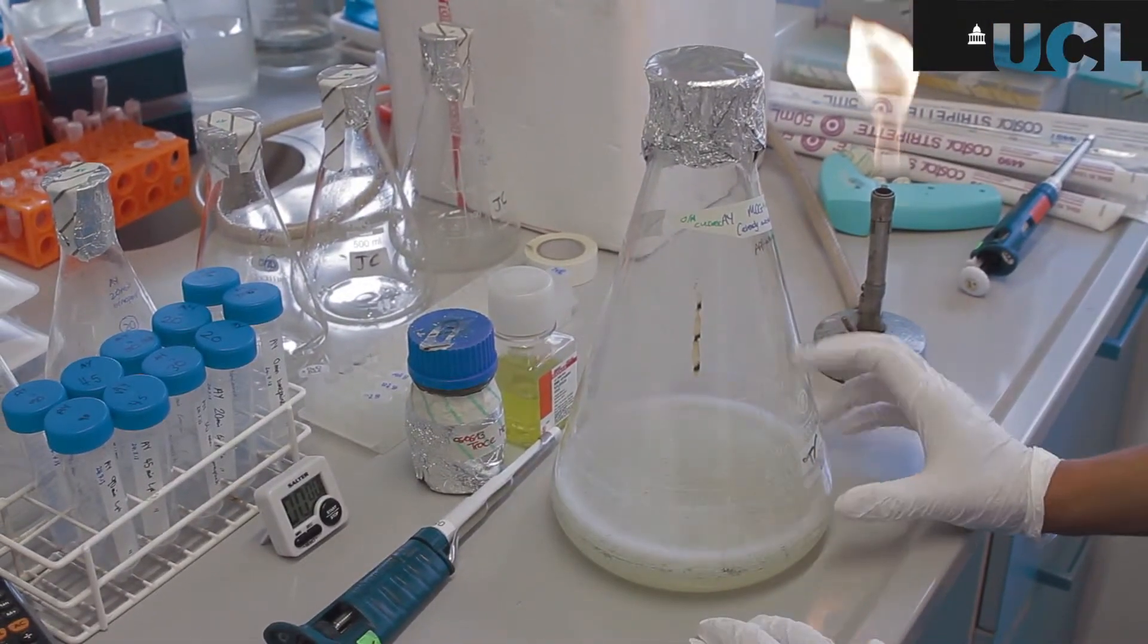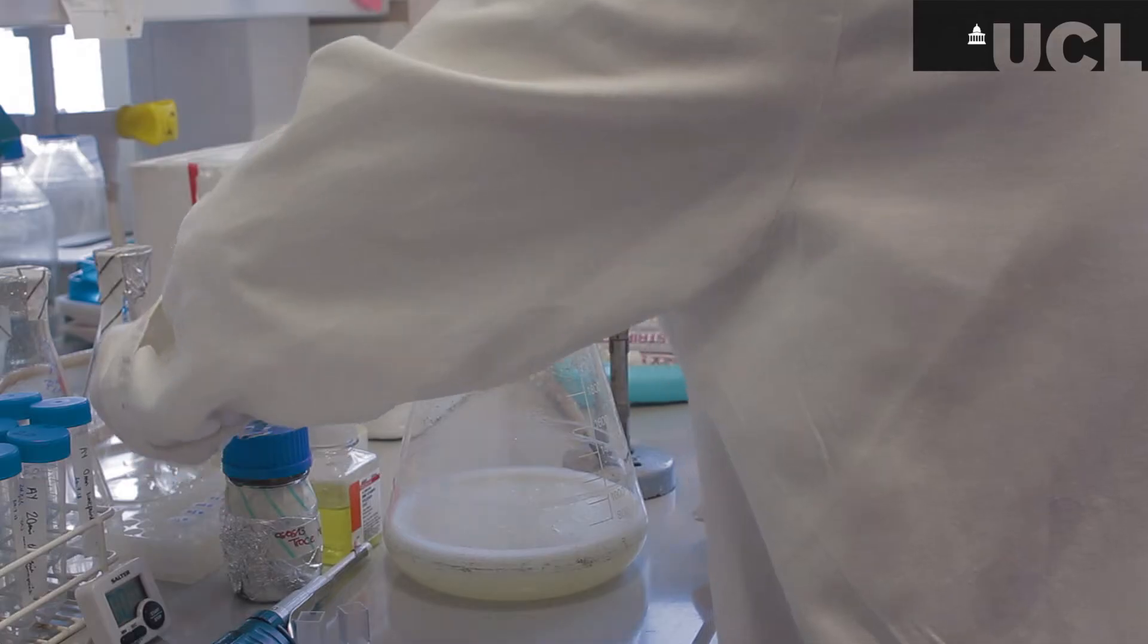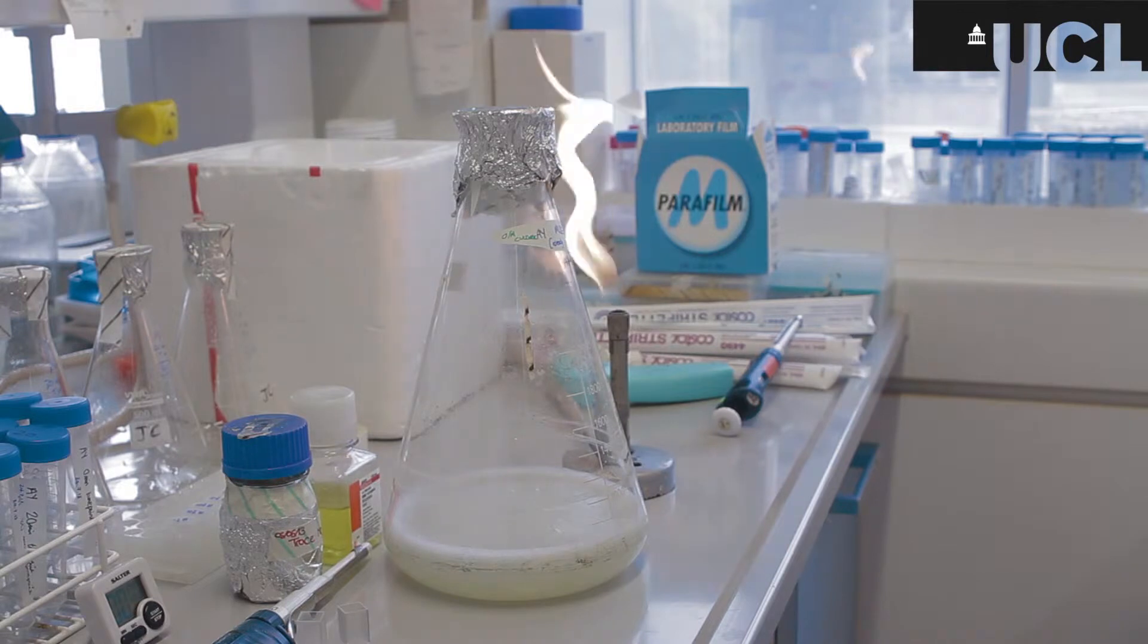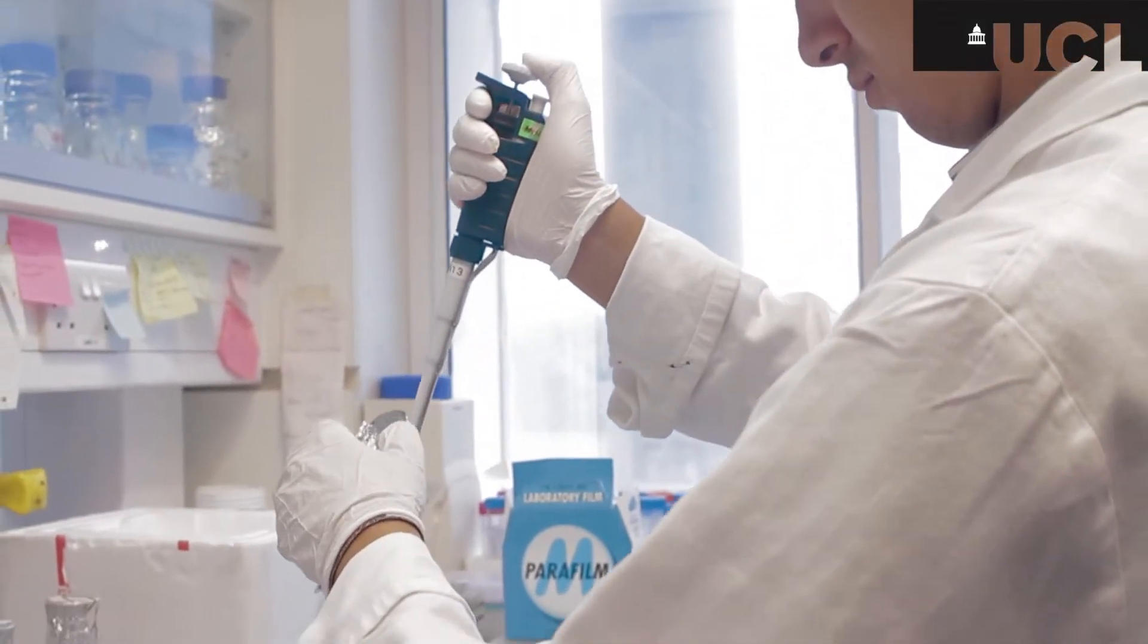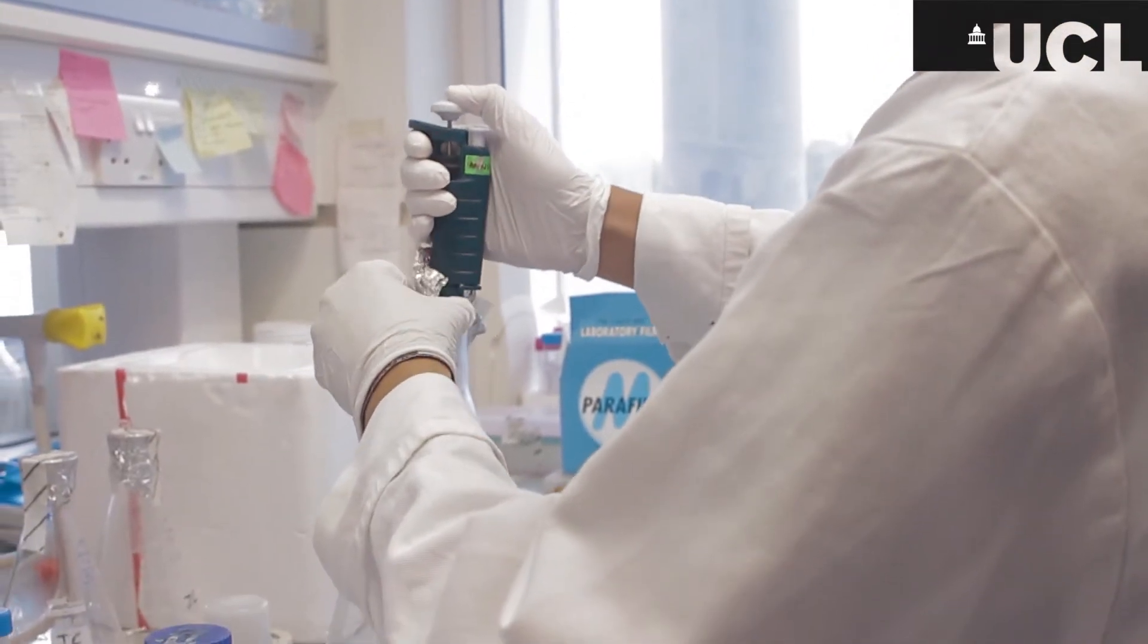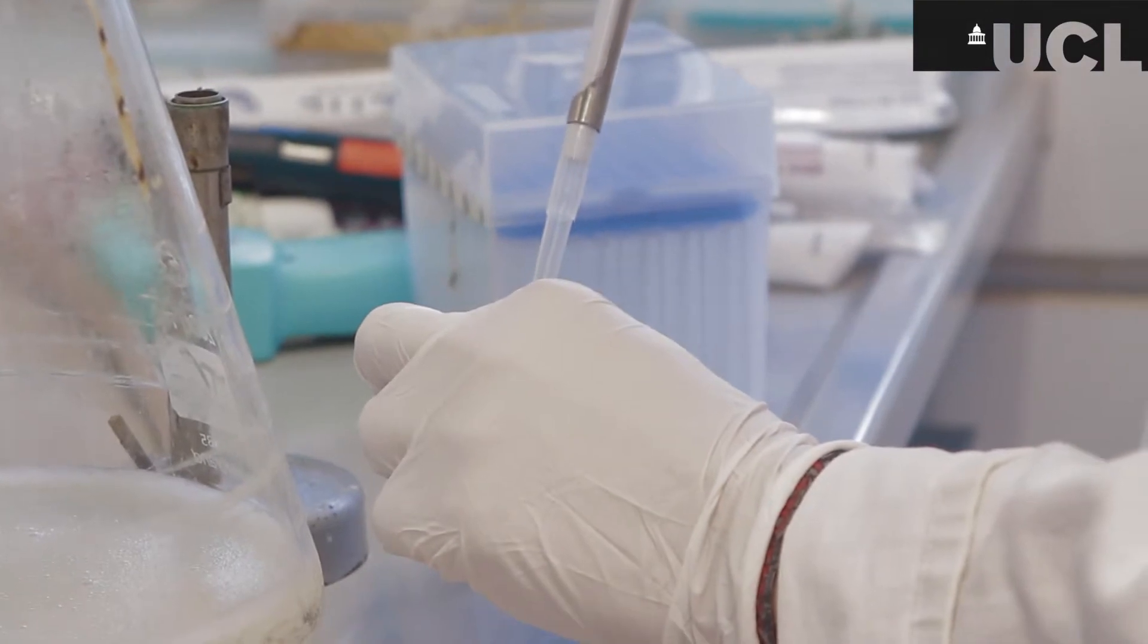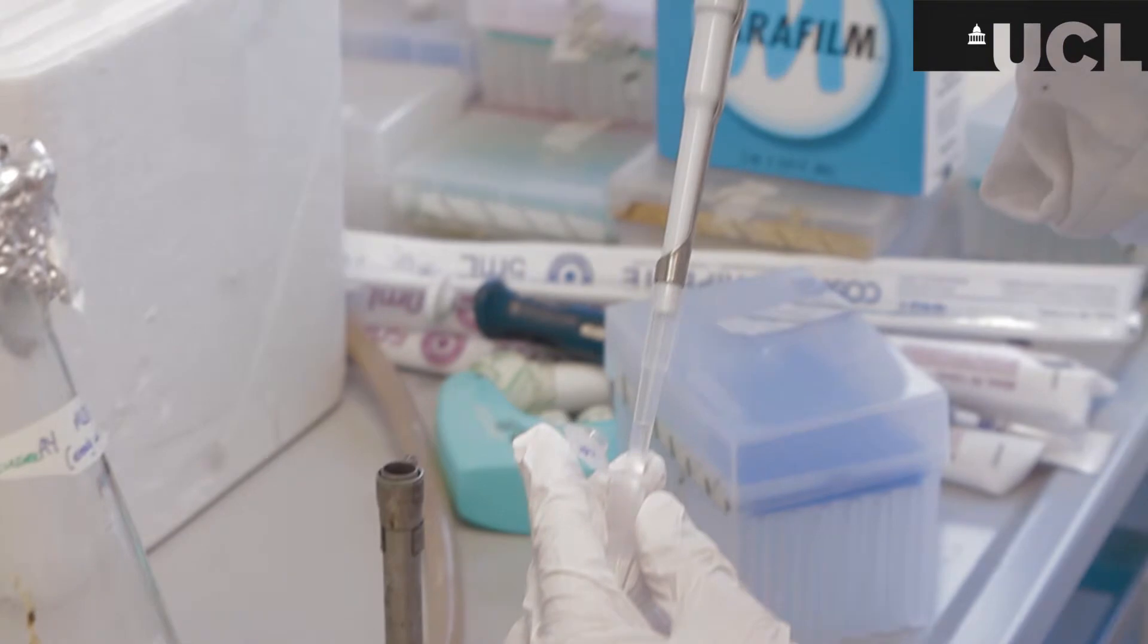Okay, so this is the overnight culture. I transformed the cells and then cultured them overnight and this is what I've taken out of the incubator. In order to assess the level of growth overnight, I'm taking an optical density measurement using a light spectrometer and that will give me a rough idea of the concentration of cells.